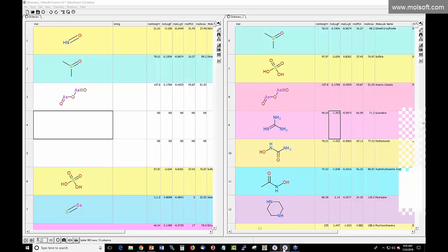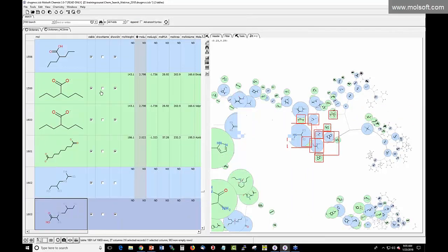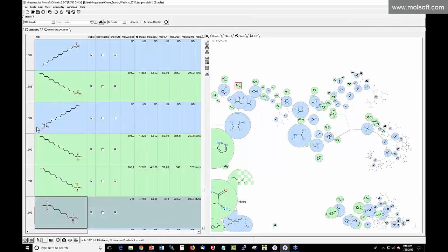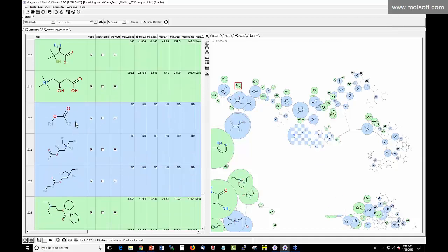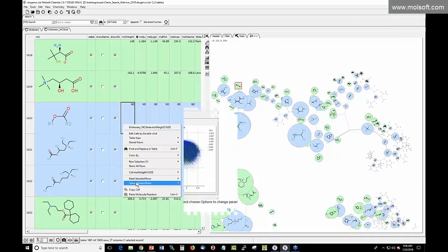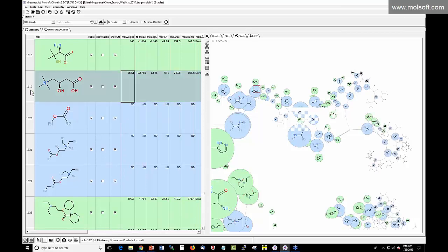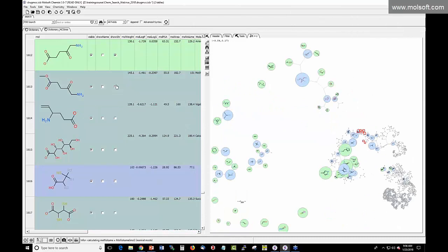You had a question about the dendrogram. Can the dendrogram only display the substructure and not the compounds? Yes, so basically you can make selections in the table, and the substructures are highlighted in blue. So if we select all rows marked green, basically make a selection of the ones you don't want to display, and then you can uncheck here, uncheck visible, and then they'll become hidden.